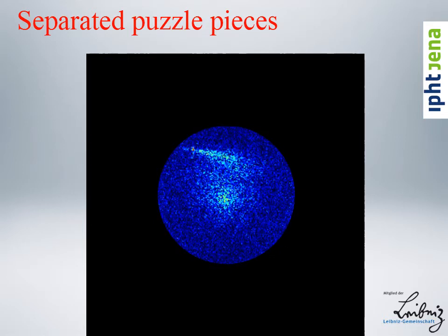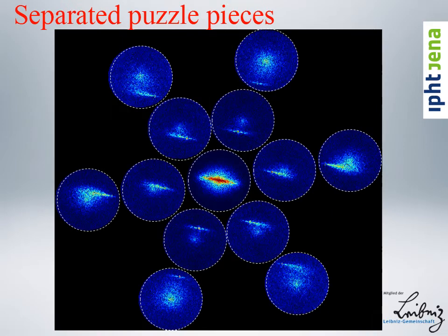Now, when you put them all in a picture, I will show you in a second, but you see again, as a reminder, the resolution improvement comes from the fact that you're measuring from the minus edge of the aperture from one side to the other side, which is twice the distance than would normally be accessible from the center to somewhere. So if you then repeat this in 3 directions, you have all these different components along different directions, and you can then put them together like a puzzle.